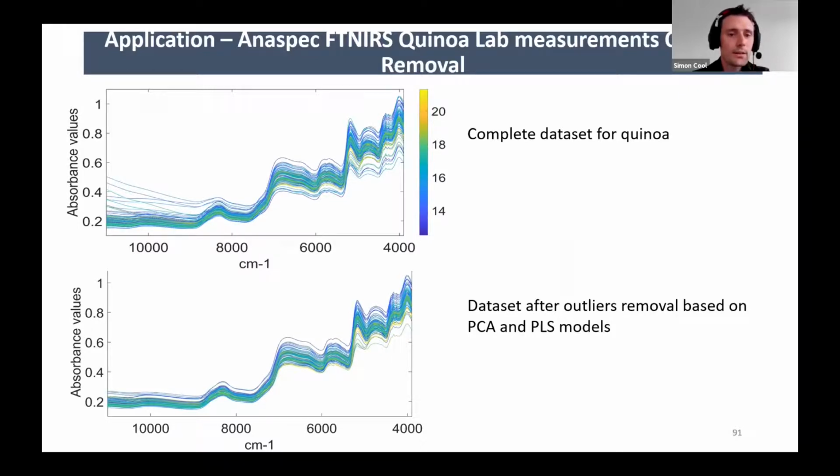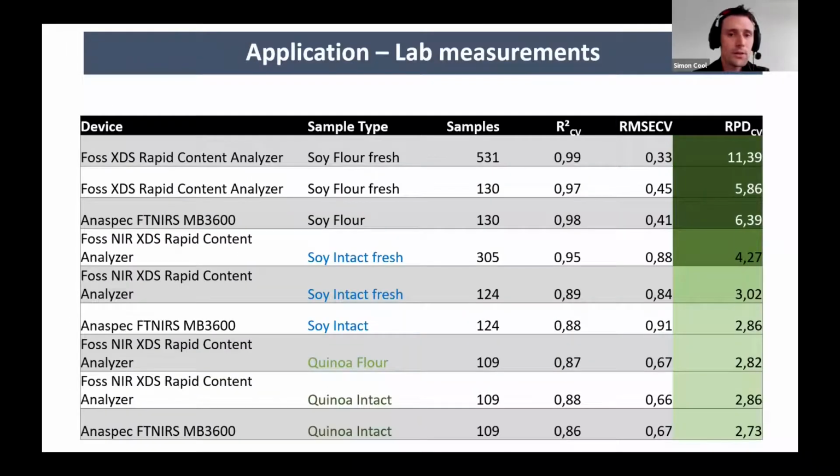That quinoa data set had a lot of visual differences between the different samples. And you see clearly some very strange things happen for some kinds of quinoa. And this was caused in most cases by, for example, black beans, black seeds, or white seeds instead of the beige colored seeds. Here you see the results you obtained with the high-end spectrometers to do the quantification.